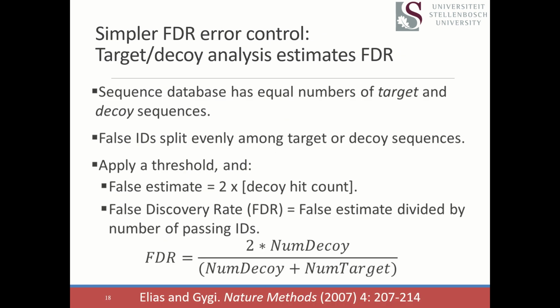Now that's quite a lot more complex than the simple Target-Decoy method that a lot of people use. And complicated can mean good and it can mean bad. And there are times when you're going to want to use something like PeptideProphet, and there are times when you are not. So in a lot of the cases, we use a Target-Decoy approach.